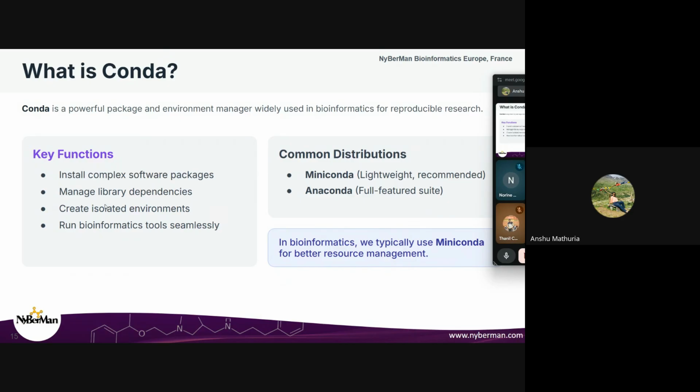It can create isolated environments. Again, the same feature: the packages that are installed in one environment will remain in that environment and are not going to clash with the other packages. Then you can run the bioinformatic tools seamlessly. The tools can be installed and executed very easily, and they can be present only in a dedicated environment.